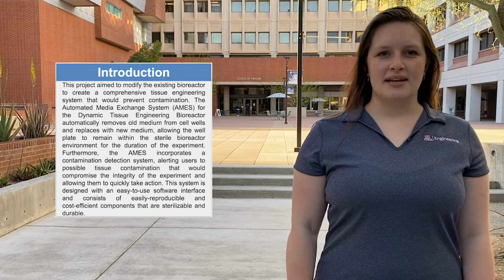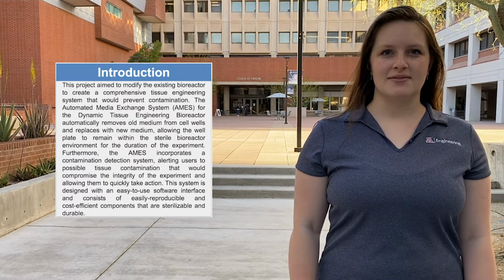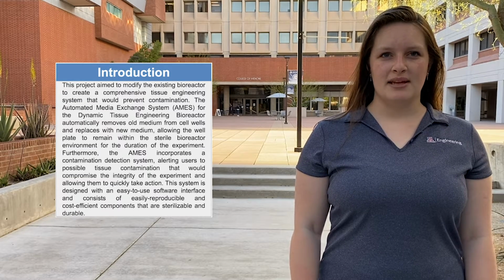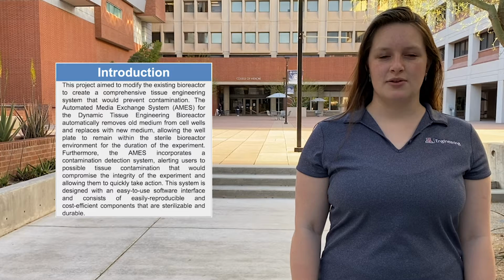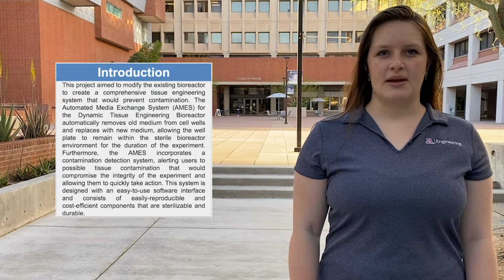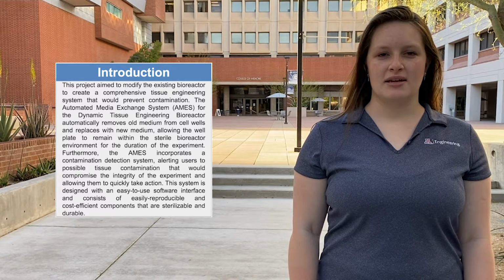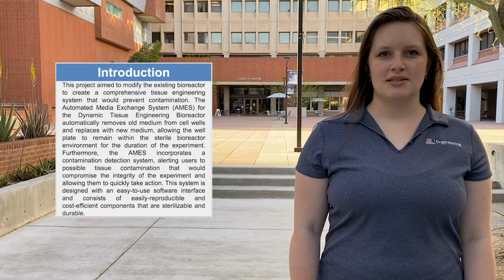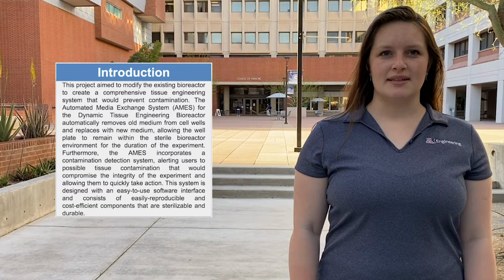The Automated Media Exchange System, or AMES, for the dynamic tissue engineering bioreactor automatically removes old medium from cell wells and replaces with new medium, allowing the well plate to remain within the sterile bioreactor environment for the duration of the experiment. Furthermore, the AMES incorporates a contamination detection system, alerting users to possible tissue contamination that would compromise the integrity of the system and allowing them to quickly take action.